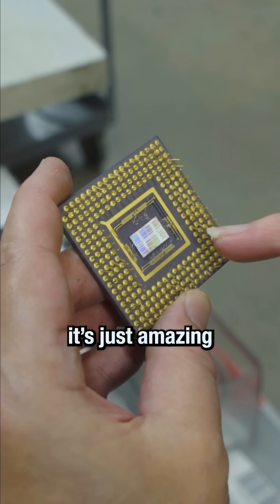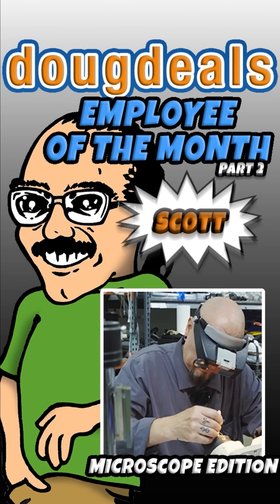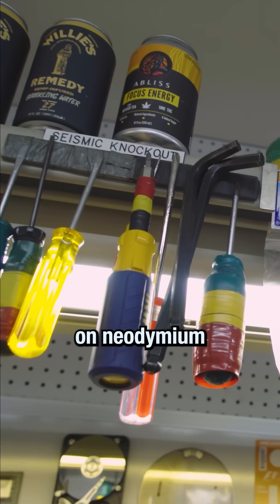When you look at some of this stuff under a microscope, it's just amazing. So my main table — this is where all the magic happens. All of my tools are held up here on neodymium magnets.